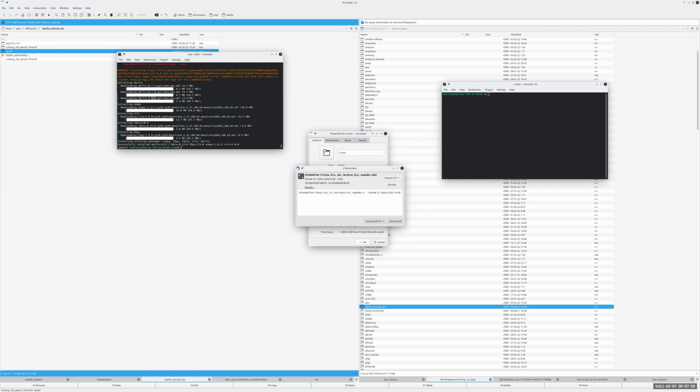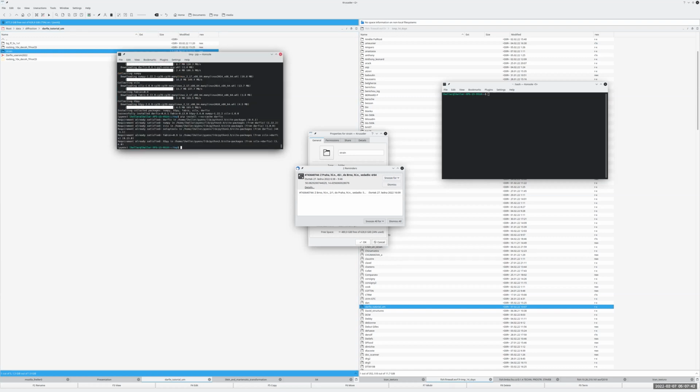You can try this command. Okay, put them both, no cache. Okay, exactly. It still gets, so what we will try to find, but it works. The last version of Darfix is the one I put in the chat now. Yeah, but it works.